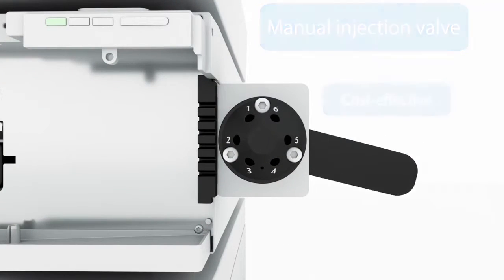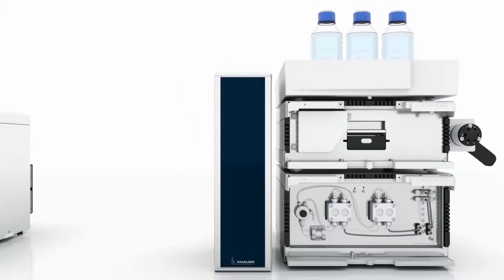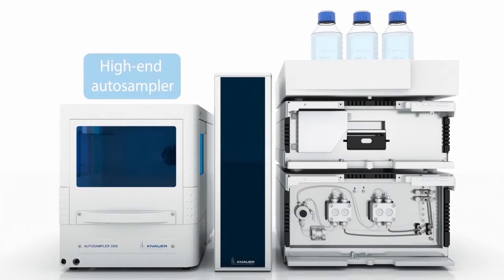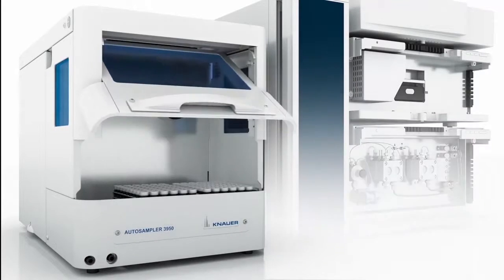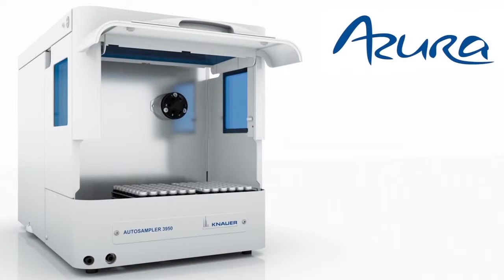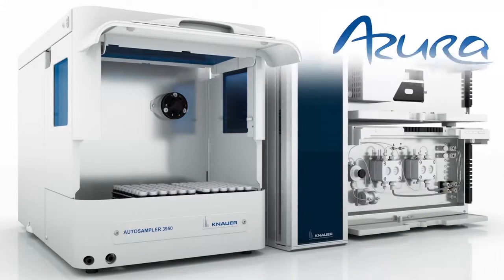Use a cost effective manual injection valve to inject your sample up to 1000 bar. Or choose between different high-end autosamplers like the shown autosampler 3950 with injection volumes from 0.1 microliters to 10 ml. With optional sample cooling, it traces up to 108 standard vials for high throughput analysis.